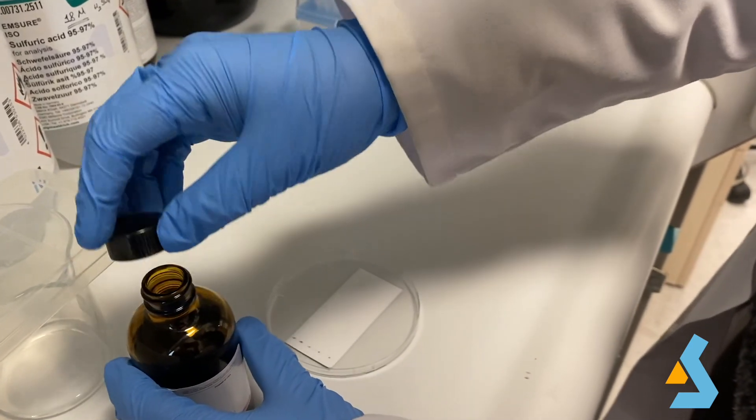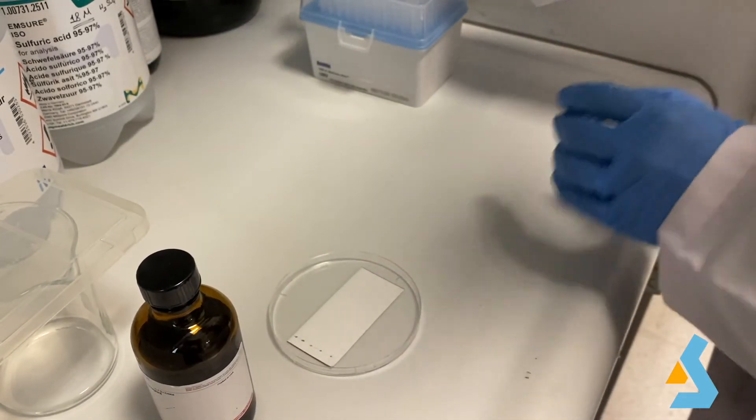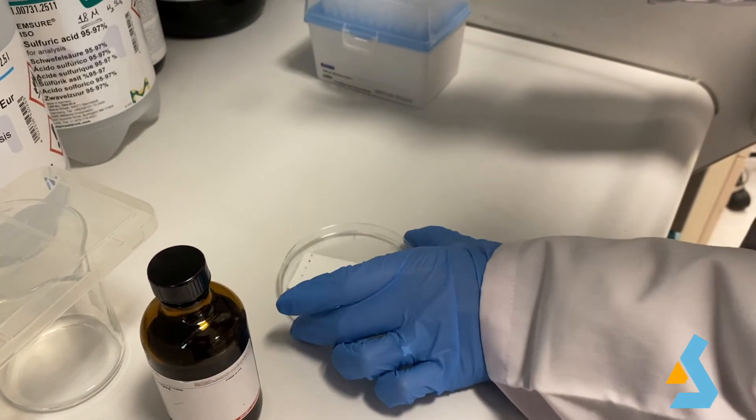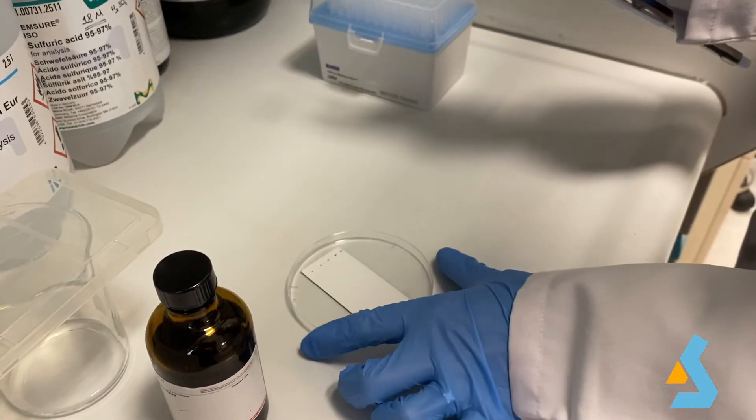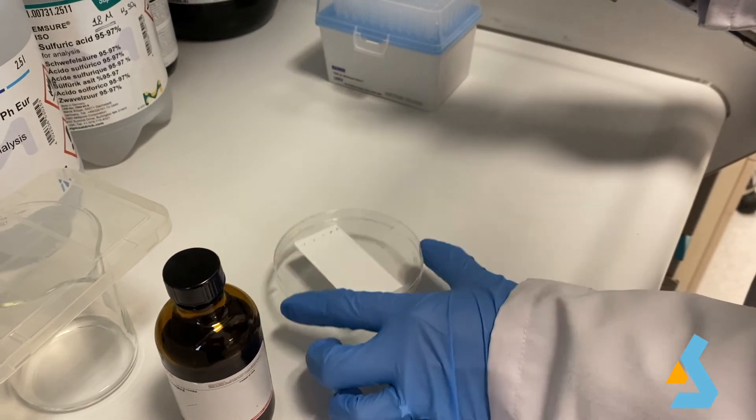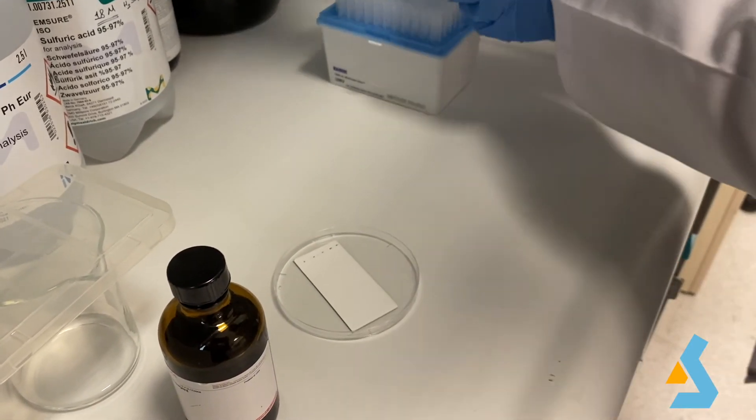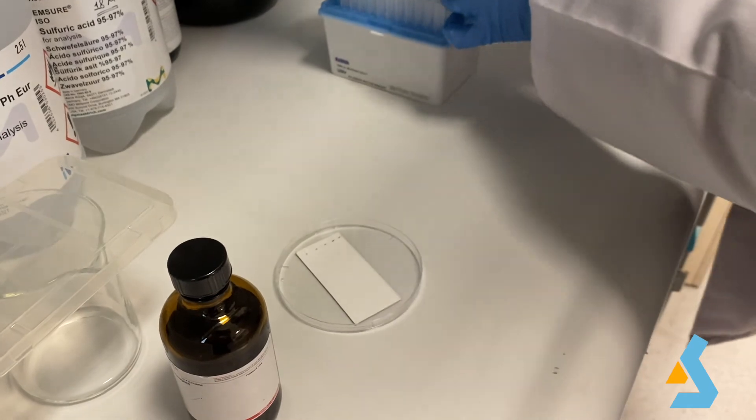After we dry the TLC plate, the ninhydrin is applied. As amino acids are colorless compounds, they can be detected on the chromatogram with the help of the ninhydrin reagent. Ninhydrin is widely selected for its high sensitivity.